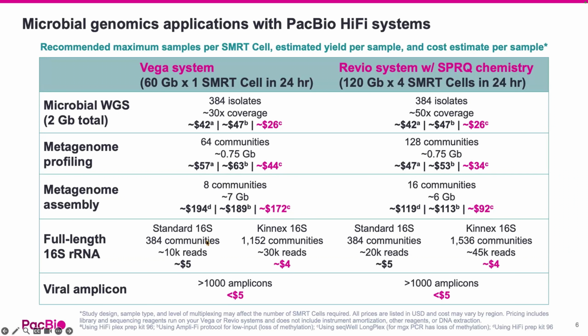And then for our 16S, we have standard 16S, which is just a single monomer of 16S or any amplicon in this case. And then we have Concatenation, which you'll hear about later, which just concatenates multiple of those 16S amplicons together to take full advantage of the HiFi sequencing, the long reads. And so when you have concatenation, it just allows you to do more samples per SMRT Cell and get a higher read depth per sample than you can with the monomer-based approaches.